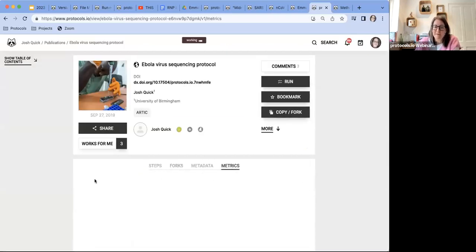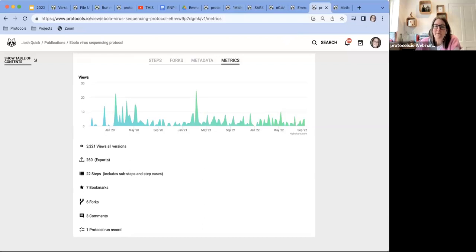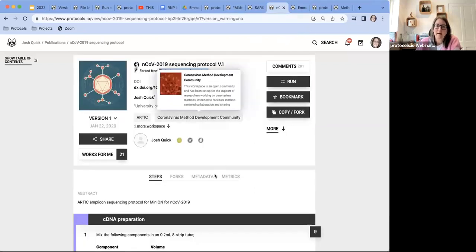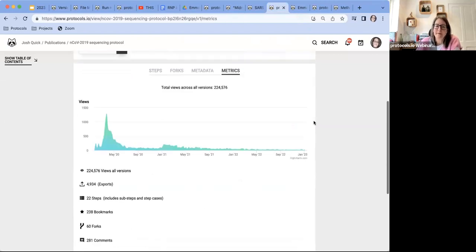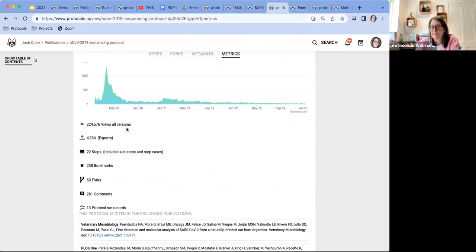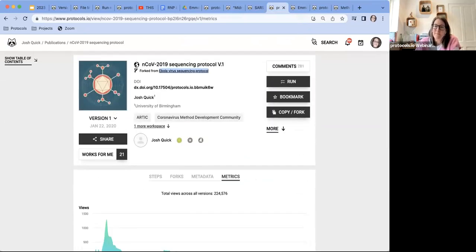So metrics for this one also, it's not actually that huge. The one that has the massive amounts of visibility are the coronavirus ones. So this has had over 200,000 views, nearly 5,000 exports. People have bookmarked, many forks, many comments. I didn't talk about comments yet. Let's have a quick, just show you comments.